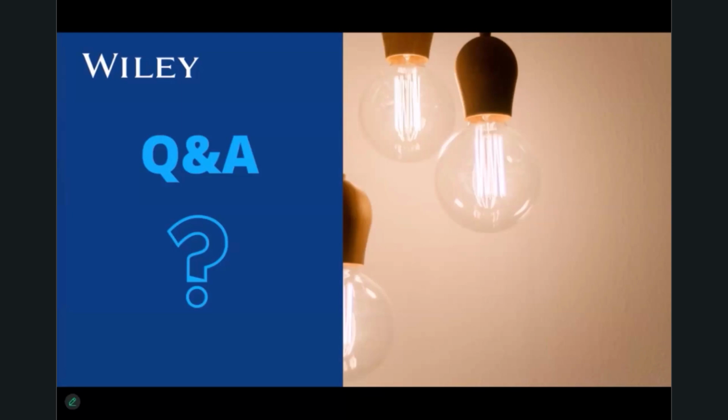Great, thank you both. How about this one? What are the typical wavelength, wave number range entries in the database? It looks like minimum wavelength is around 2.5. Similarly, how does the database handle unknown spectra of mixtures? Yeah, this is a good question. You're right. The regular IR range is up to 4,000 cm, but the KnowItAll database itself is a continuous wavelength in x-axis. So your spectrum, there's no limit.